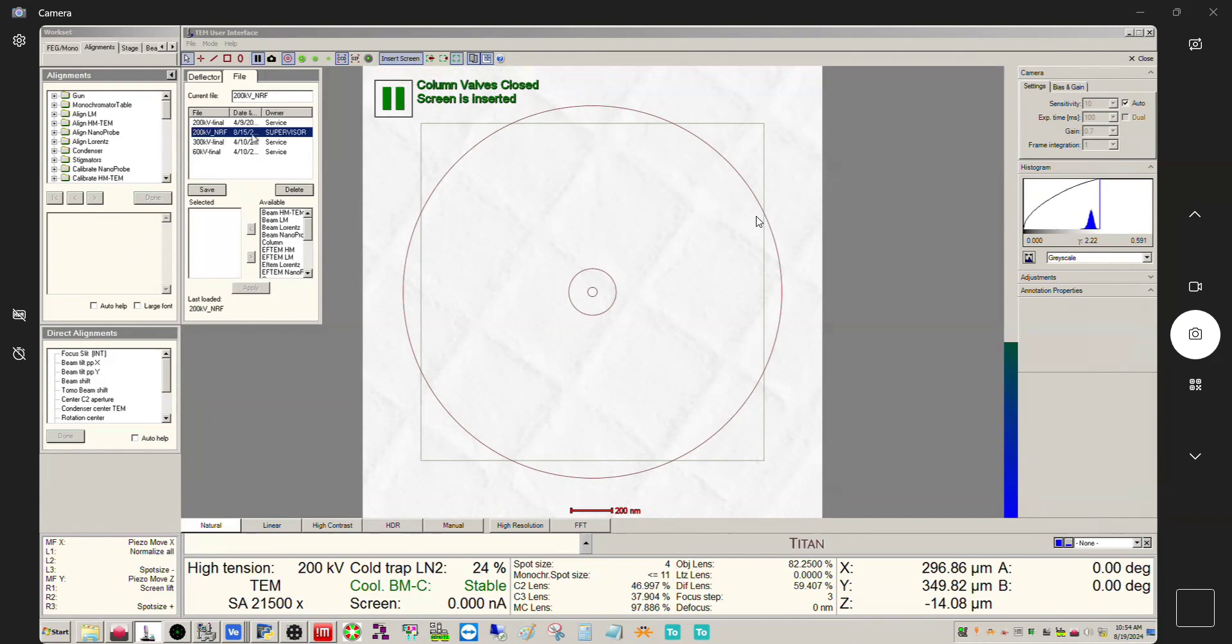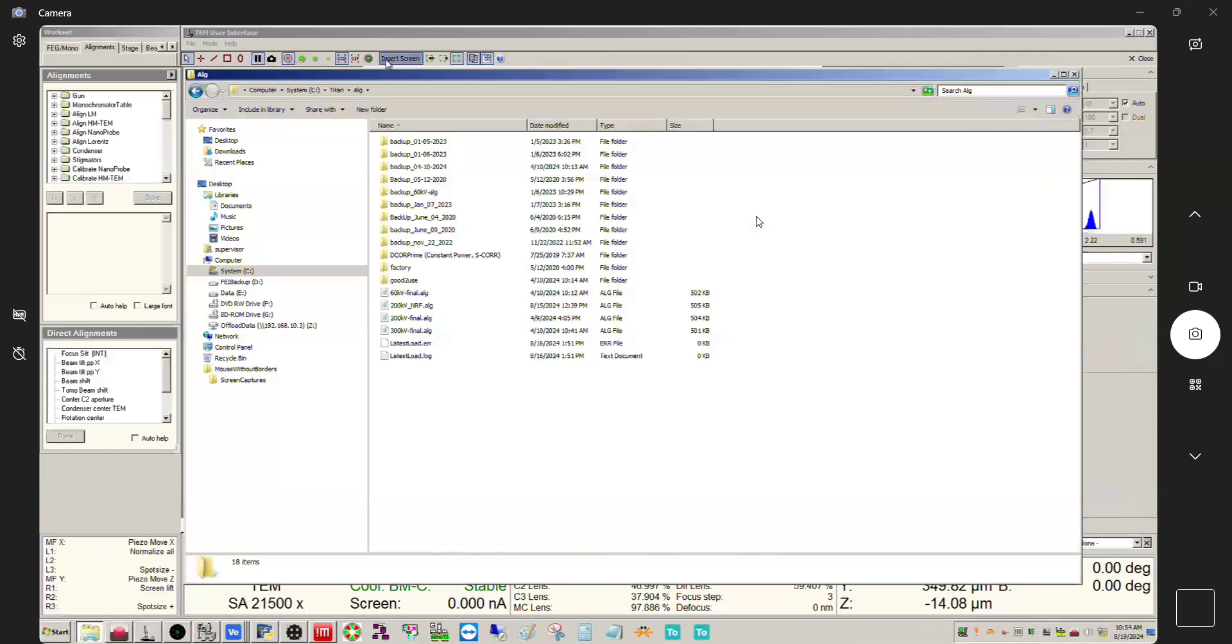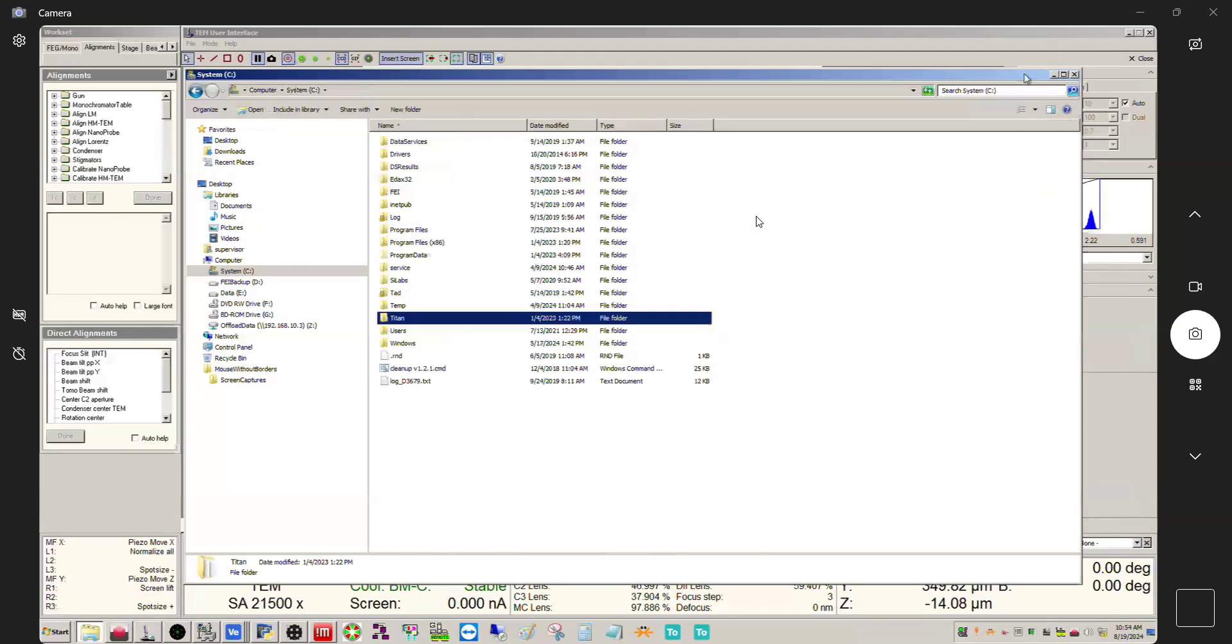You do have access to the direct alignments but that's it if you're logged in at a user level. We've been logged in at the supervisor level in order to update this alignment file and to run through all these alignments. I believe actually if you're logged in as user you're not going to see any of these, maybe with the exception of gun.